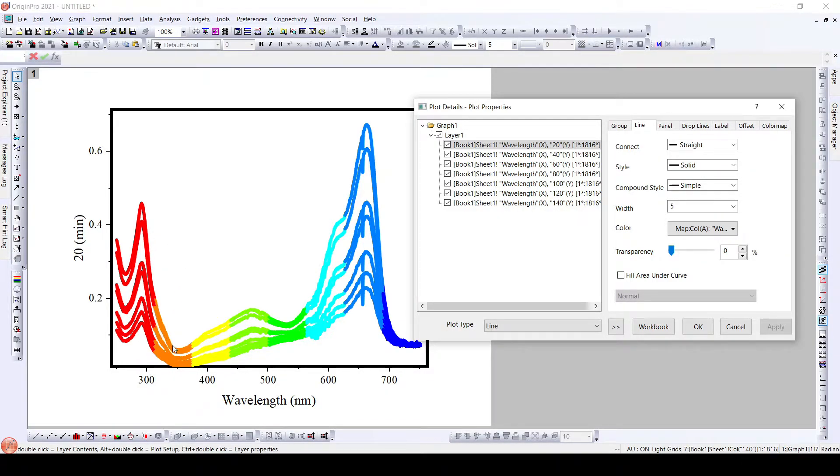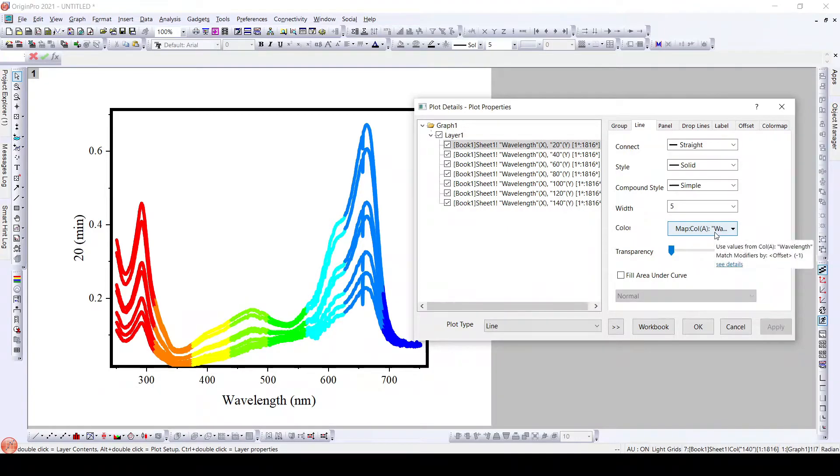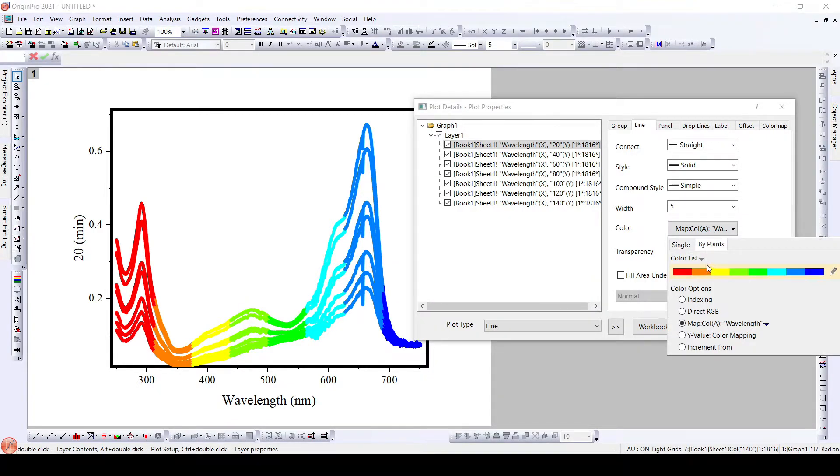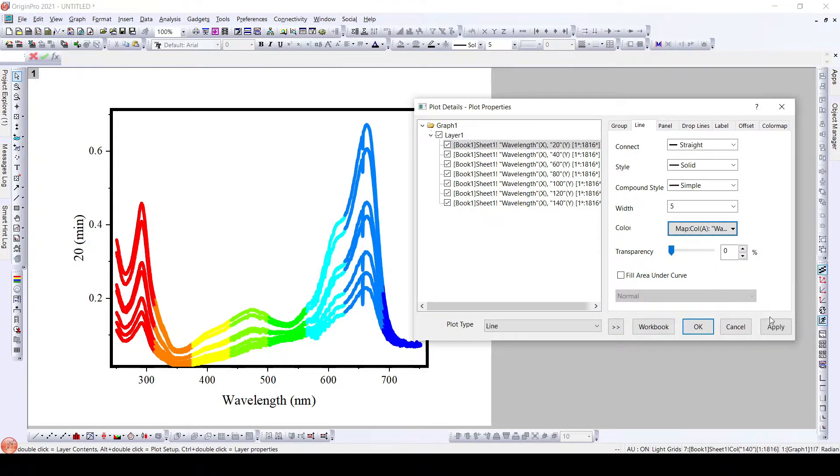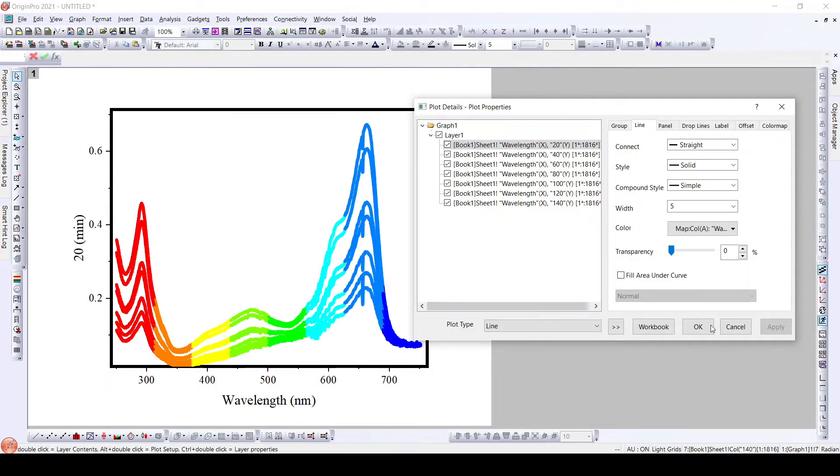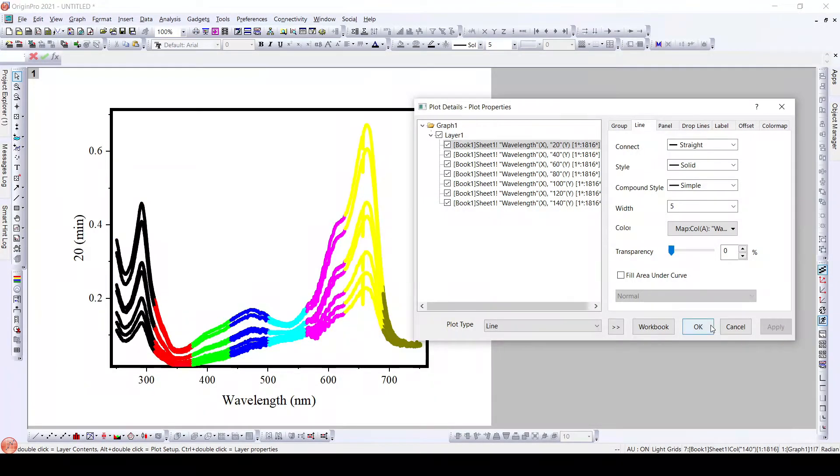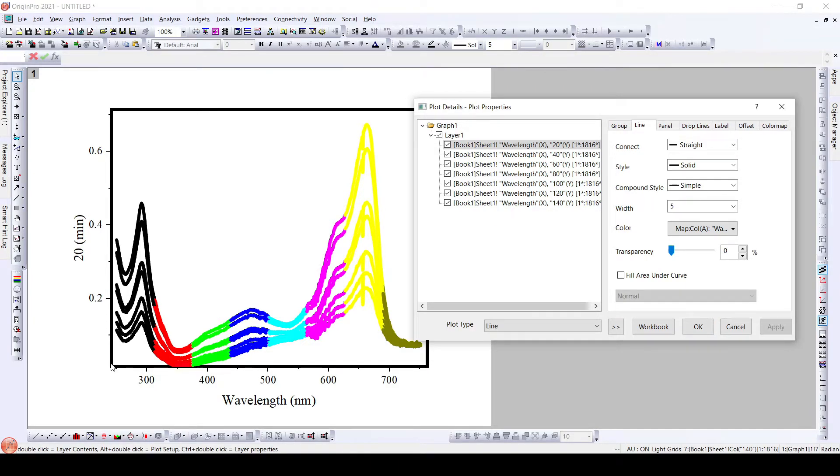Here the color scheme got changed. We can have the classic here and we can have the same color scheme that we used earlier, that is black on the lower side and green on the higher side of the spectrum.